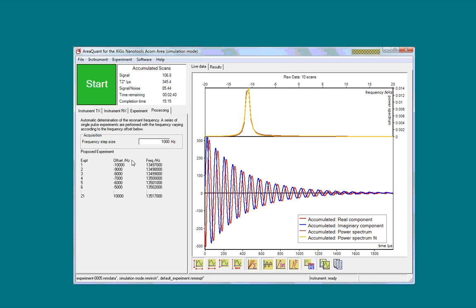Now, in the software, when we were performing the measurement, trying to find the resonant frequency initially, these steps are a lot bigger. We start off with 10 kilohertz steps, and then after a sweep of all 21 data points is produced, we go back and refine that step to a 1 kilohertz step. So I'm going to let this continue, and you're going to see that this peak here in the Fourier transform is going to slowly move towards the actual resonant frequency. As that happens, you'll also notice that the number of periods in this captured wave will decrease. Let's watch that.